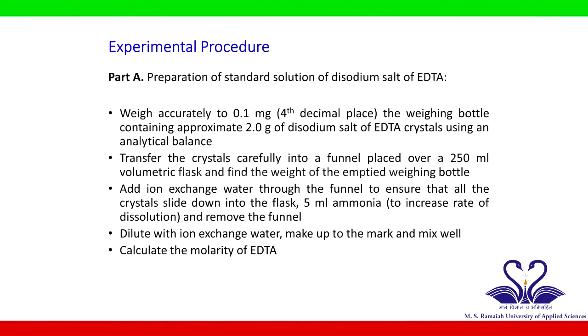Procedure. Since EDTA is sparingly soluble in water, the disodium salt of EDTA is used for practical purposes. Now, let us prepare the standard EDTA solution by weighing 2 grams of disodium salt of EDTA crystals and transferring it carefully into a 250 ml volumetric flask.